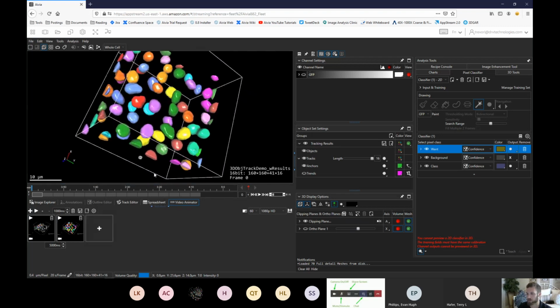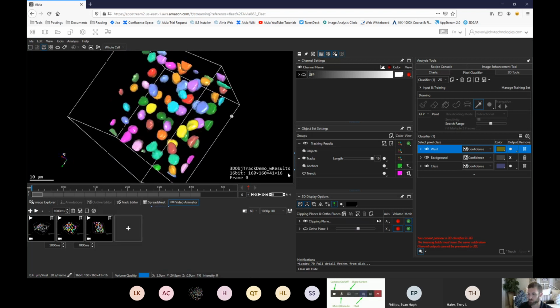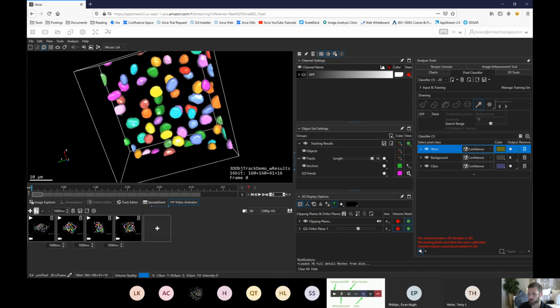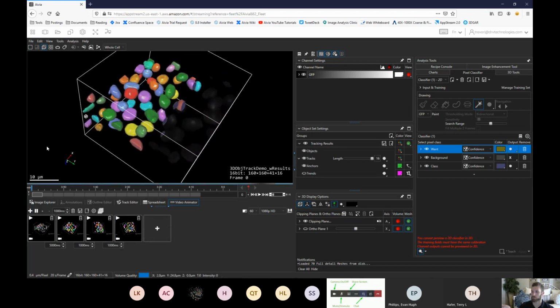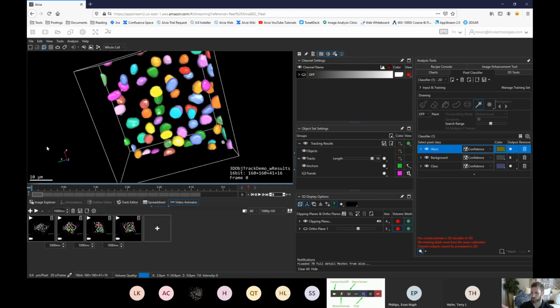And basically in Aivia Community, I can string together any 4 of these. So if I make a few more, then you'll see I've got this really slow animation to begin with, and then it's going to go quickly to those other 2 camera movements I made. Whenever I'm done, I click save. Really simple. And the 4 panels is something that you can use to get creative with, to convey the most amount of information with kind of a limited scope of video, if that makes sense.